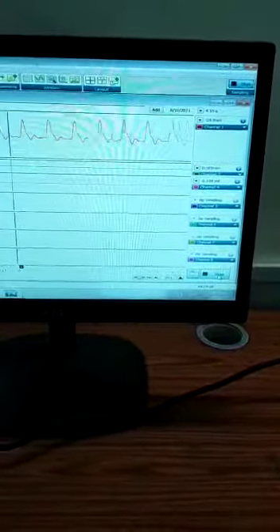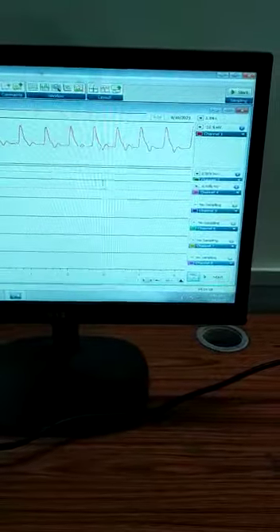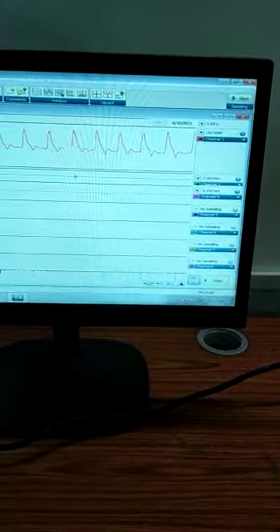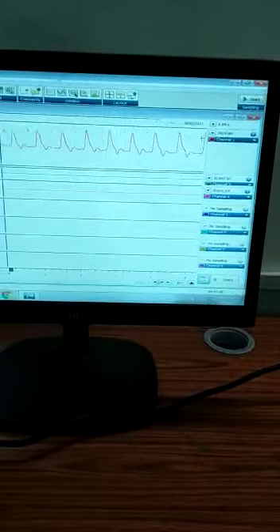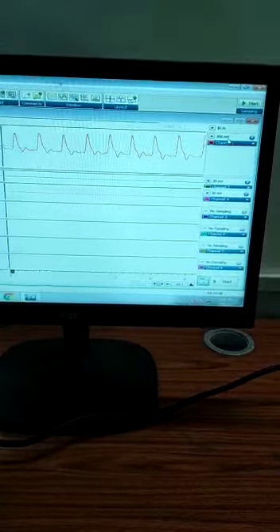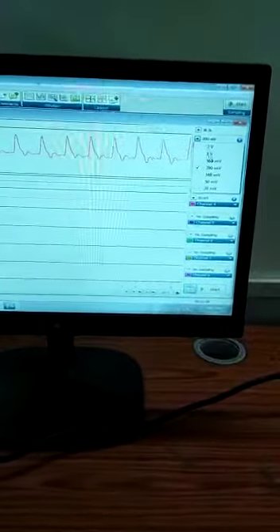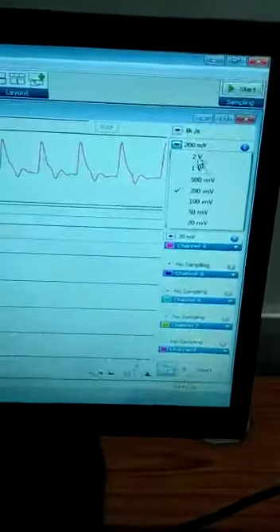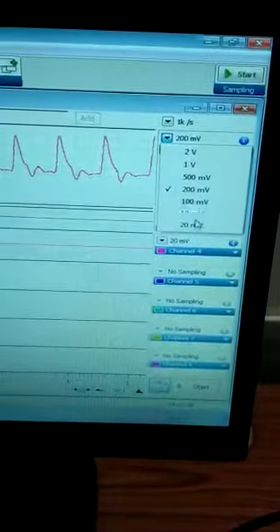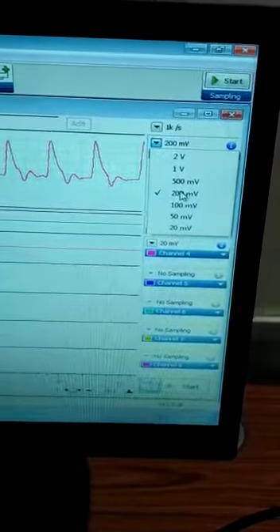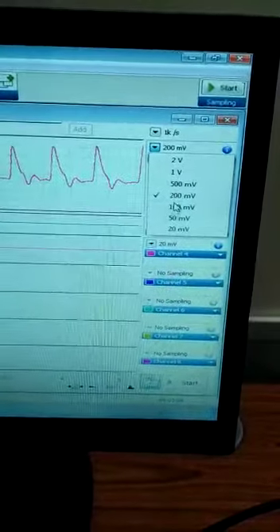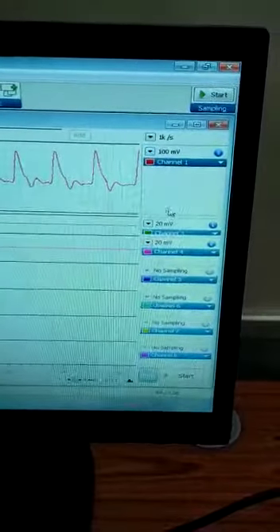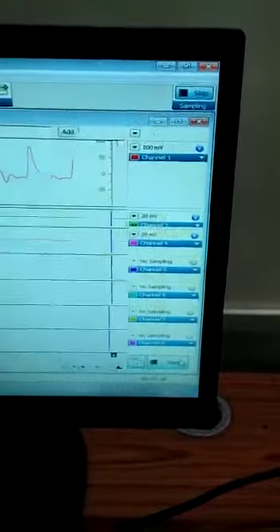Now once I press stop, the waveform ceases. You can see these are the voltage settings. You can change the magnification by using this voltage setting - 20 millivolt, 50, 100, 200. Now if I make it 200, see, the signal amplification takes place.